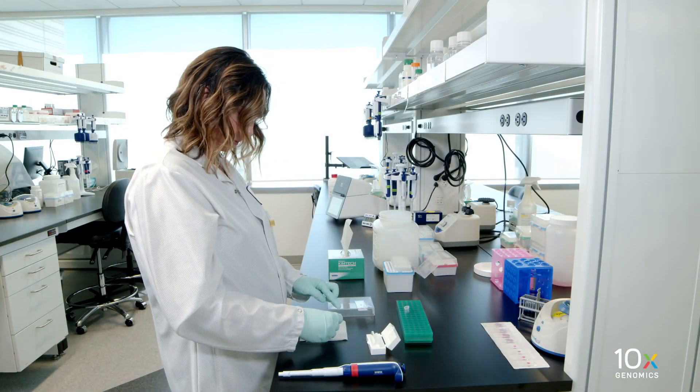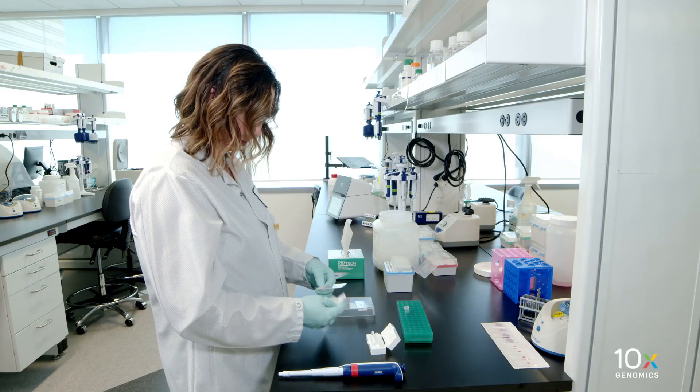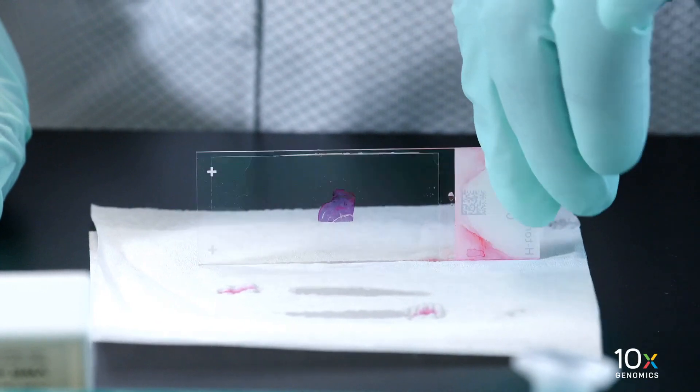If needed, remove any large excess of mounting medium by carefully wicking away from the edge of the cover slip with a laboratory wipe. Be careful not to move the cover slip and disturb the tissue.